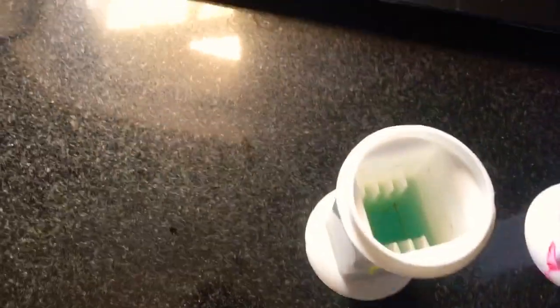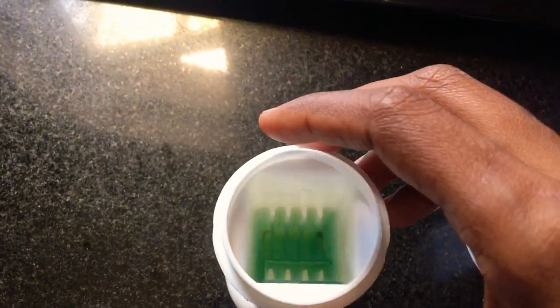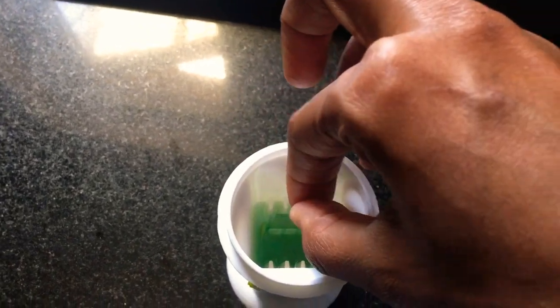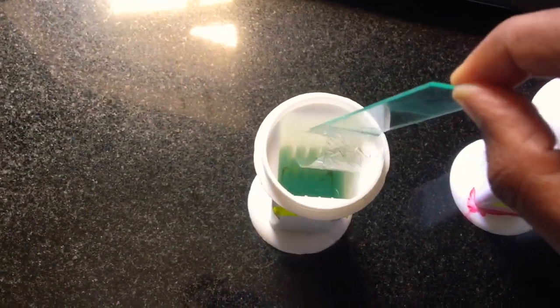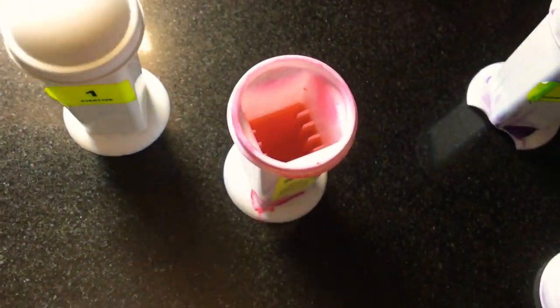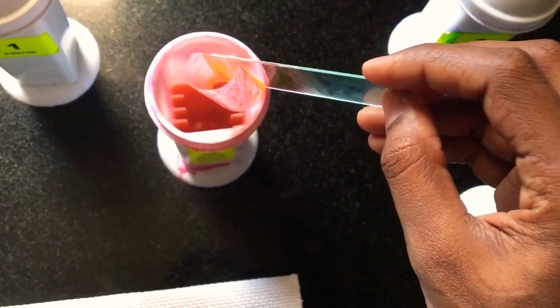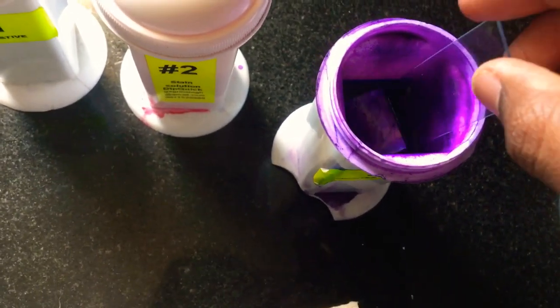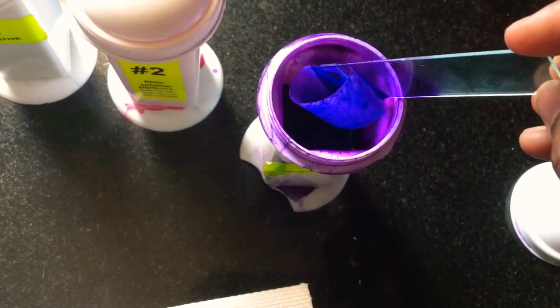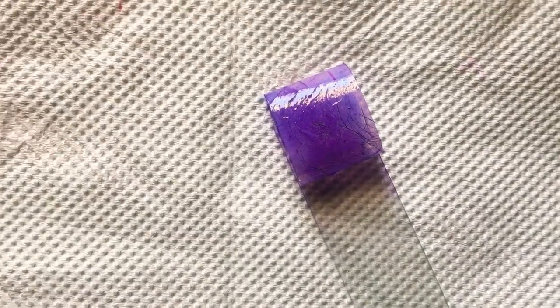The stain that I use is Diff-Quik. We need to fix the sample for at least 5 to 10 seconds in the fixative solution. Followed by fixation, we need to stain it in solution 2 for 10 seconds. After staining in solution number 2, we proceed with solution number 3 for 10 seconds.